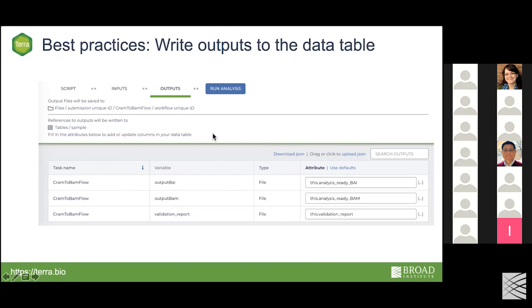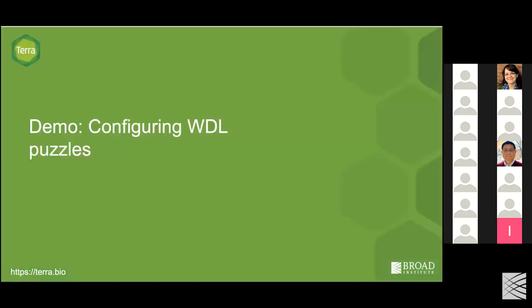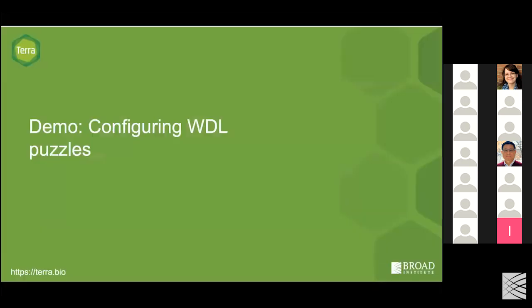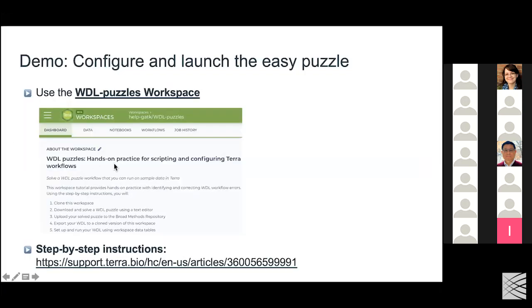So today we're going to get some hands-on practice configuring that little puzzle that we just solved. And this should feel pretty familiar after doing the first data tables quick start tutorial that we did. But this is going to give you an opportunity to go in and practice this a little more yourself at a slower pace. So let me just show you, pull up the instructions of what we're going to do.